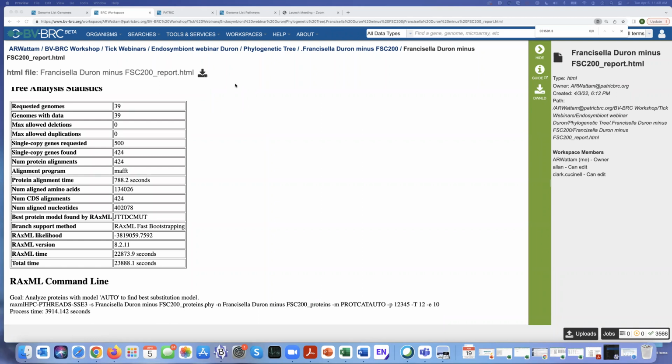Okay, now, just because you're my closest friends, I'm going to tell you this. Right now it says 100, but actually you can add 200 because there's a little bug and it hasn't been fixed yet. But another thing you have to do is think about it. What's going to look good in a publication?